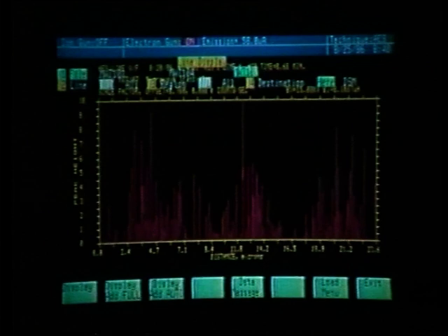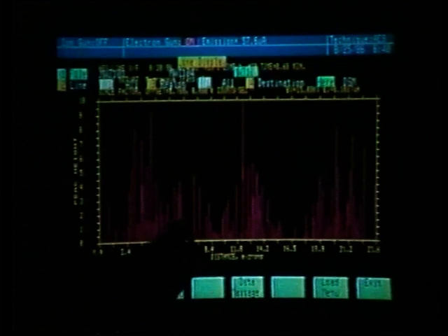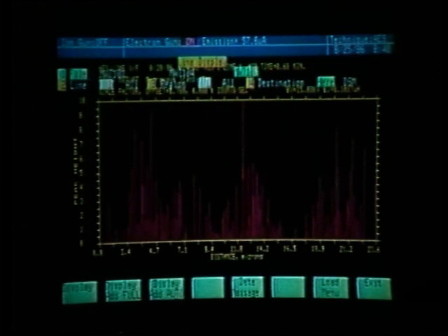Line number 1 was our line scan across the tantalum and silicon area where we saw no gold. Region number 1 is a display of our gold signal. Notice what we see is noise level. In evaluating this, I would like to display the tantalum and silicon, but not display the gold. Gold does not give us any information on the line scan. Again, it appears to be only noise level. We want to then leave function key number 2 display on line 1. Pressing function key 3, we now want to change to region 2 and enter.